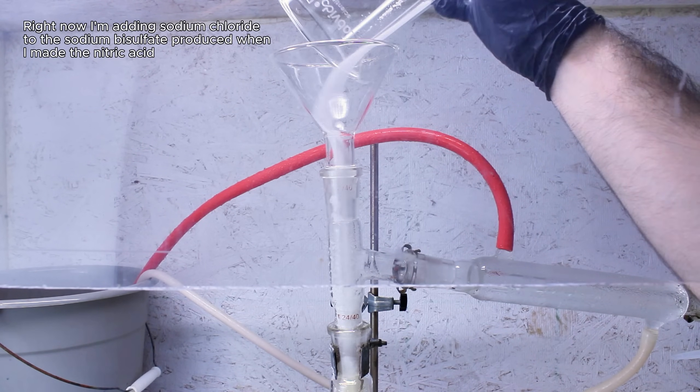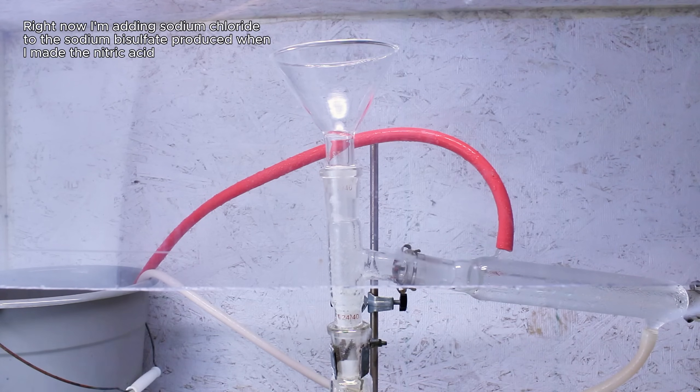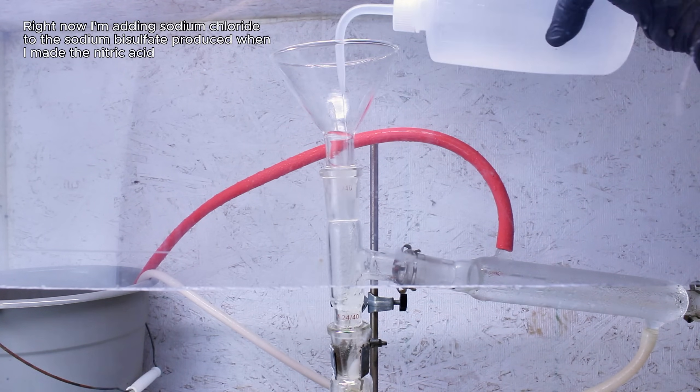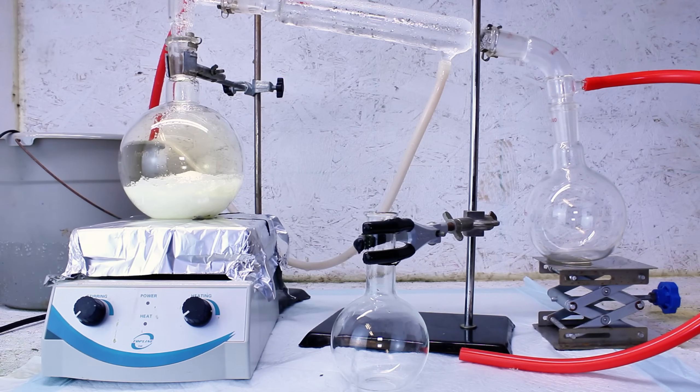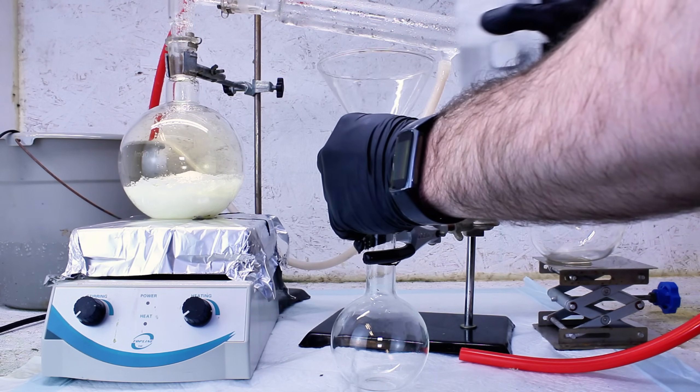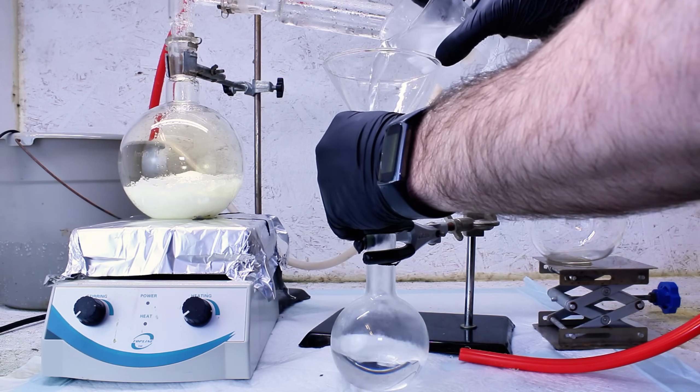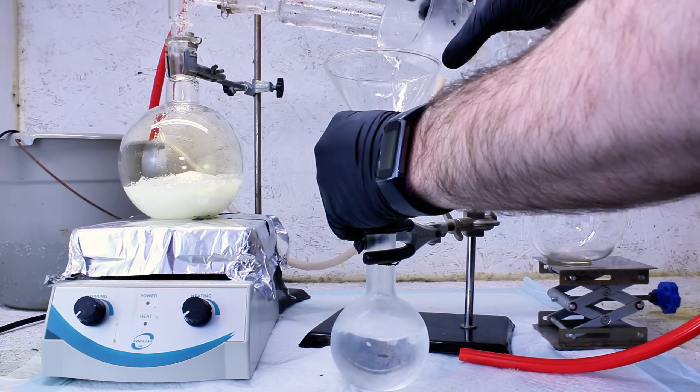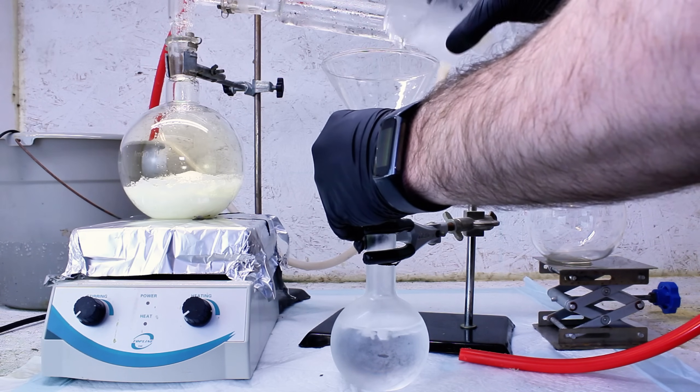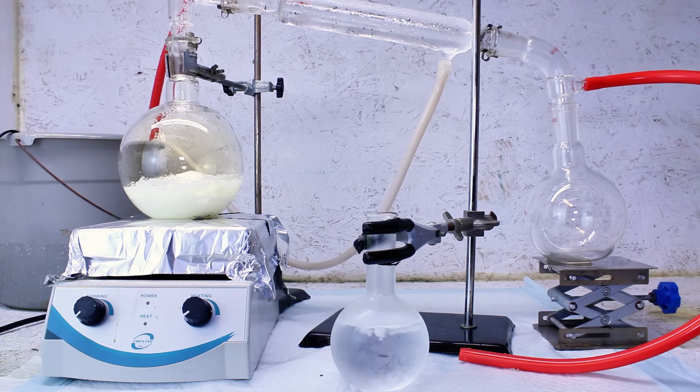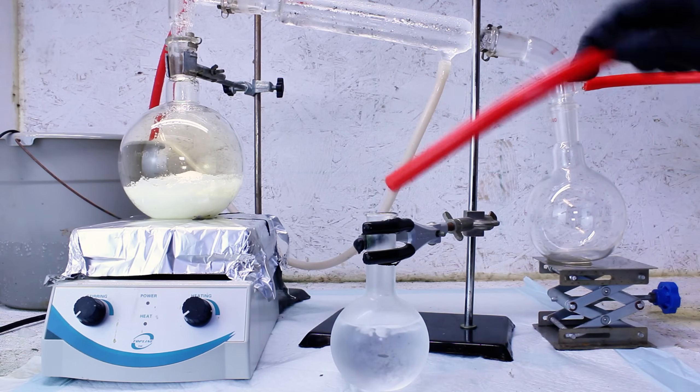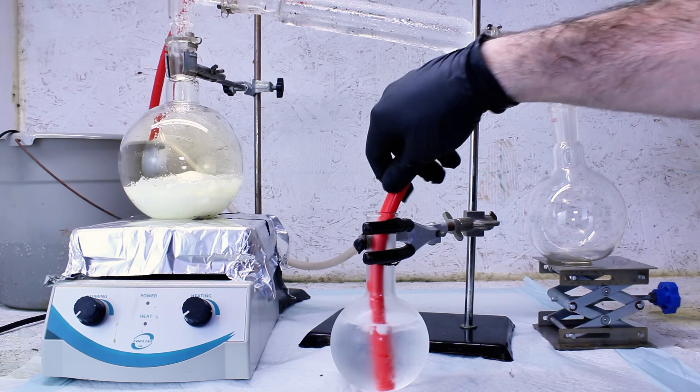With that said, just like ammonia, there is a maximum solubility of each of these gases in water, which increases as temperature decreases. Hydrogen chloride specifically has a solubility of 673 grams per liter of water at 30 degrees Celsius, which I like to use as my maximum when I make my own hydrochloric acid, just to make sure all the hydrogen chloride stays in solution, even if my lab gets a bit warm in the summer.